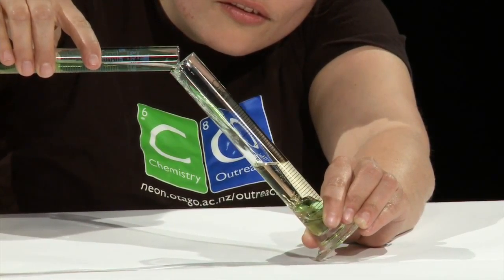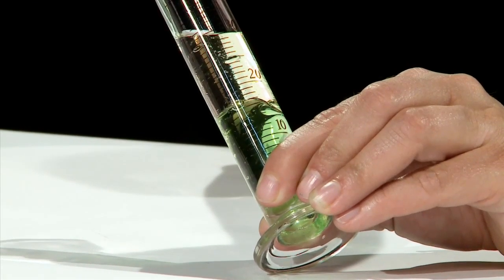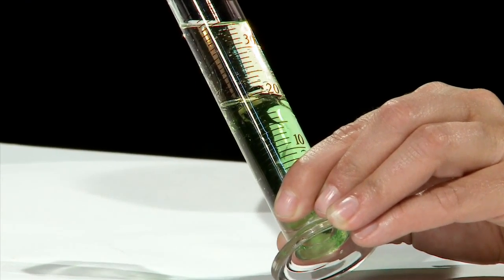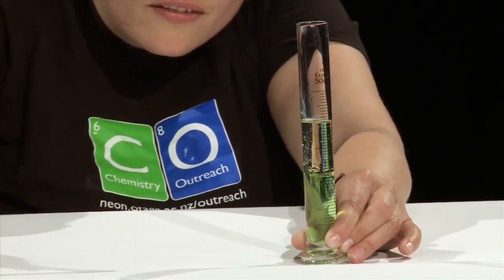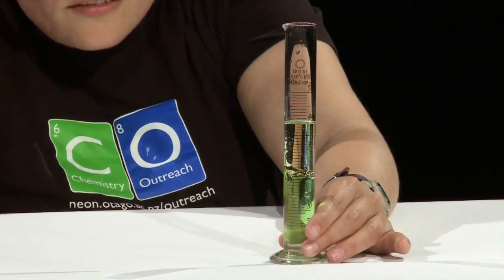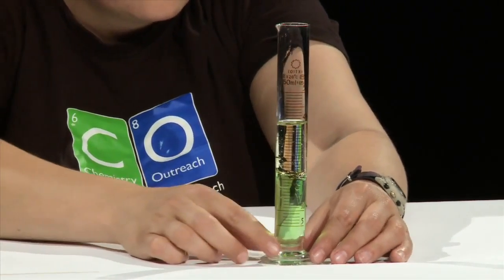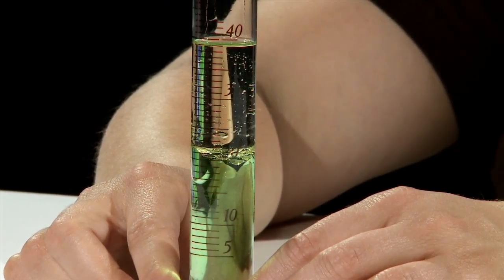Notice how the water and the oil do not mix. Instead they form two layers with the water at the bottom. This indicates that the water is denser than the oil and that the two liquids are immiscible, meaning they don't mix together.